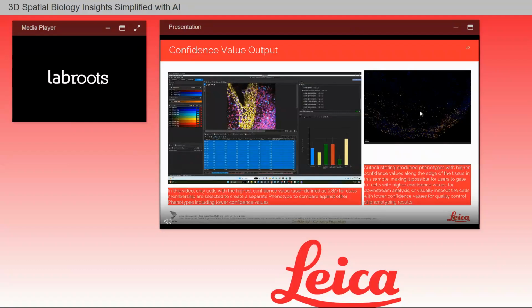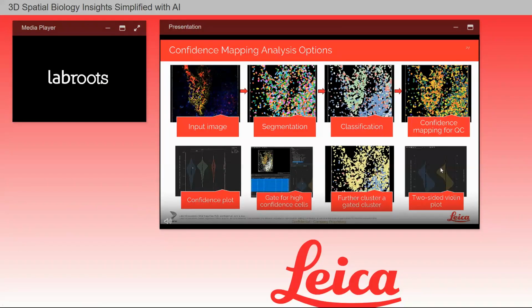In the example on the right-hand side, auto-clustering output is visualized as a heat map with warmer colors representing the highest confidence and colder colors representing the lowest confidence based on phenotypes. Curiously, the high confidence values are observed along the edge of the tissue, and this could be an interesting finding as well. Users can further explore this by selecting the blue cells with the low confidence values to retrain and update the phenotyper, for example, or users can just select the high confidence cells that you see along the edges for further analysis.